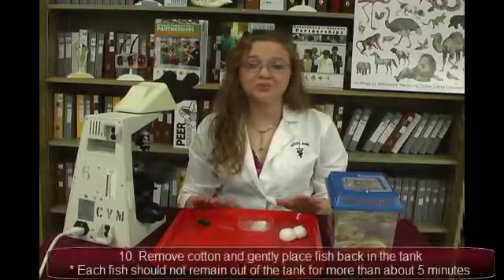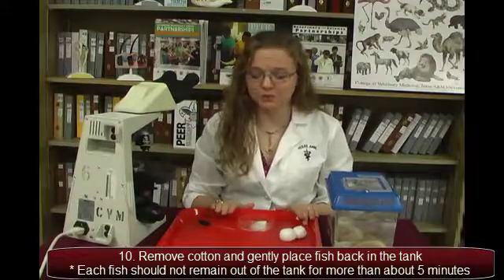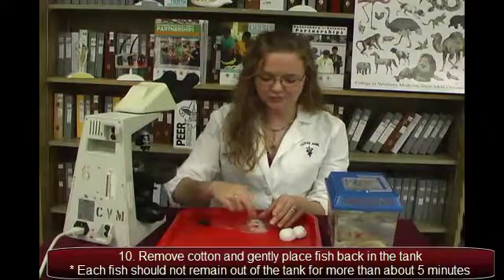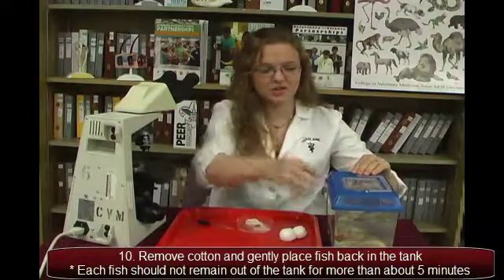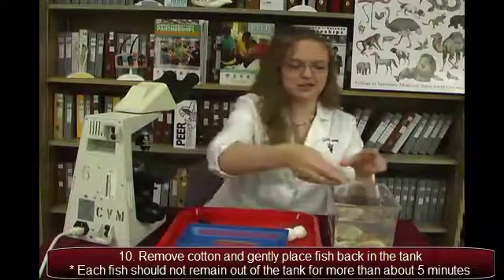We don't want the fish to be out for more than about five minutes, so now that we're done, we need to put him back in the water tank. All we need to do is carefully remove the cotton, making sure there's no cotton left on the fish, and then gently place him back into his tank.